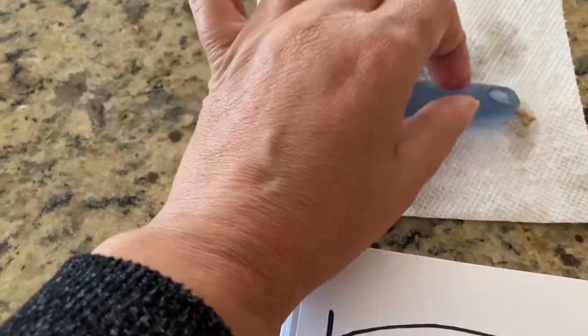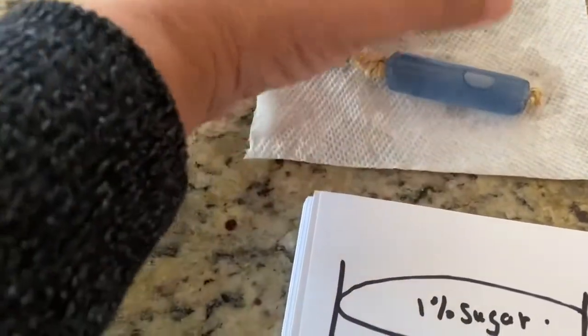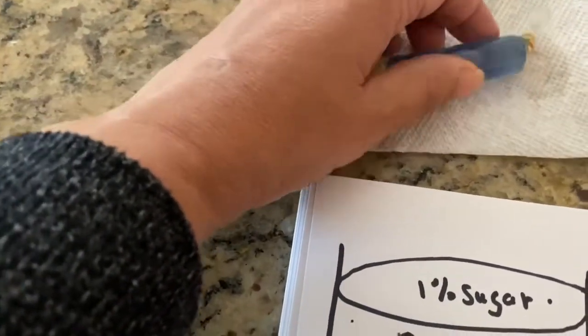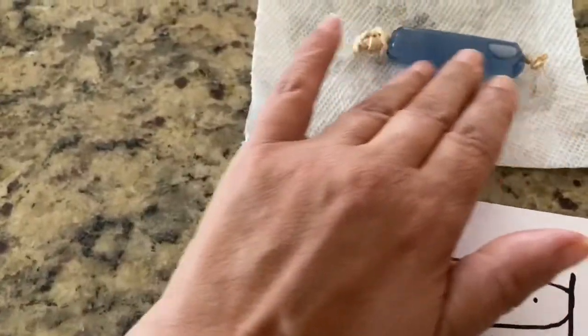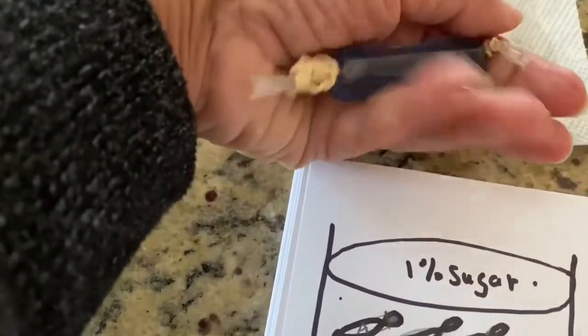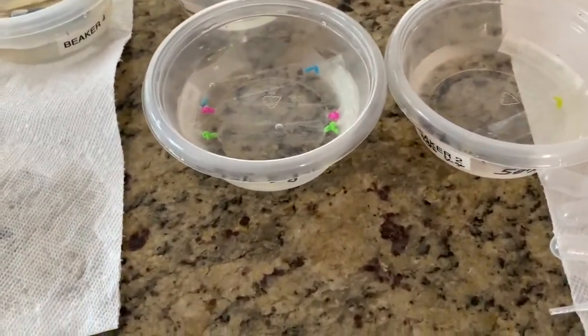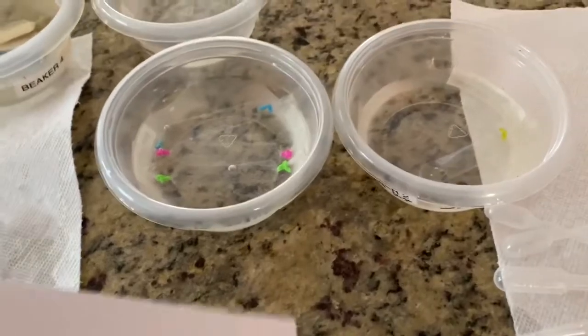And to be honest, guys, my bag became very, very hard. It seems like some water also came in. It's blowing up really nicely. The iodine came inside of the starch and turned it dark blue like that. Anyway, that's a simple diffusion. So we are going to wait like 30, 40 minutes, and wait again for our bags to see if osmosis happens.